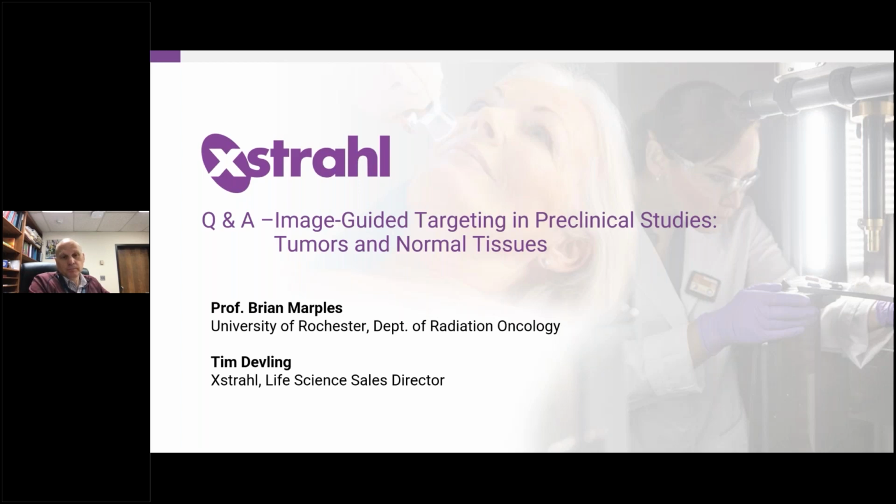Okay. And a nice question in general, I think, for all of these studies is, how relevant do you think gating would be to account for movement of the target tissue? So that is an interesting question, because certainly for the large single dose in the bladder, 30 gray, we're irradiating for quite a period of time. For the fractionated doses, less so, and certainly for the 5 gray in bladder studies, less so.